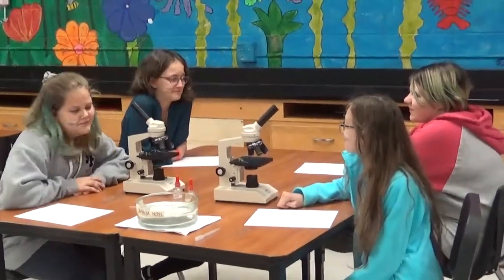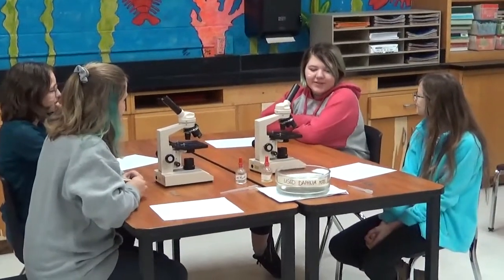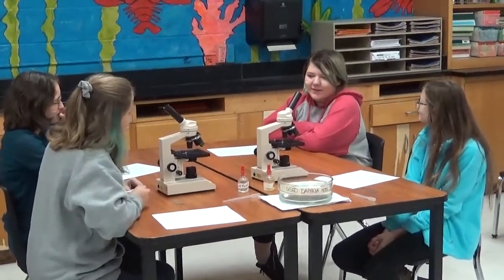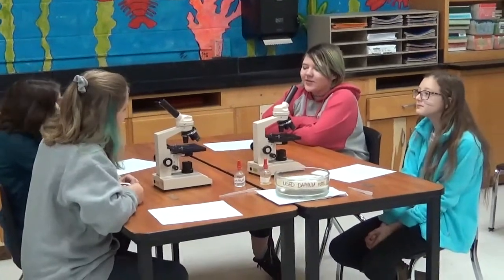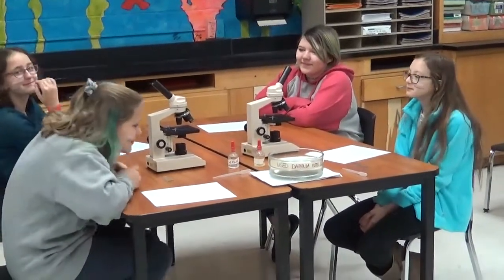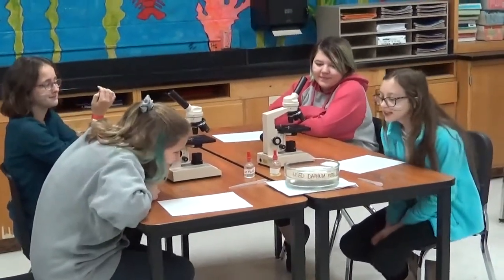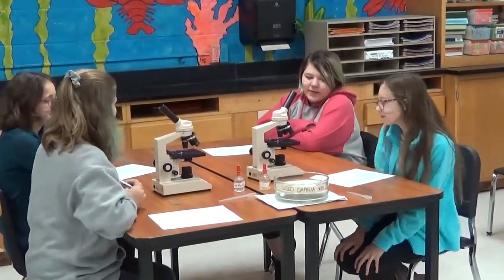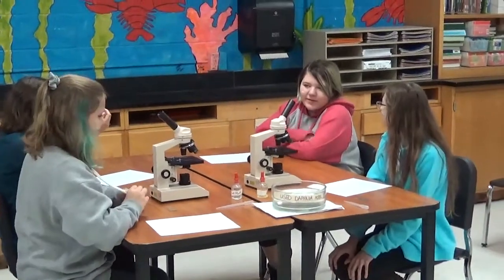Either way. Daphnia are little crustaceans that live in ponds and lakes, and they're about the size of a grain of sand on the beach. Oh, they are really tiny. Yeah, you can't really see most of them. They're bigger than normal microscopic creatures.